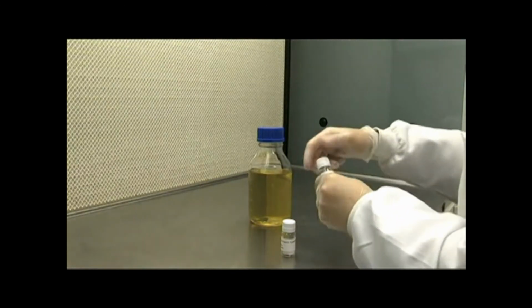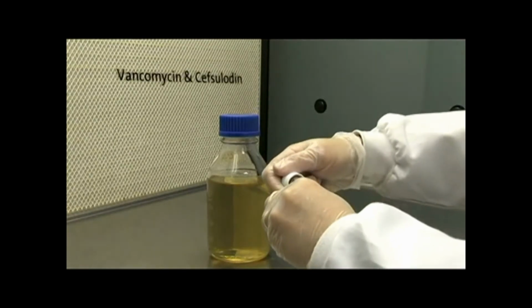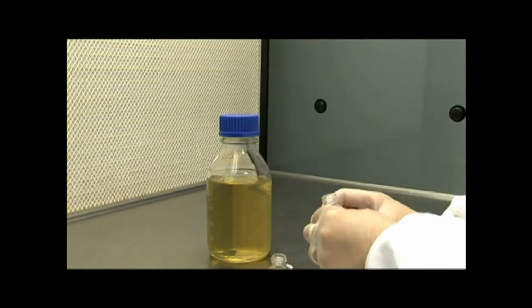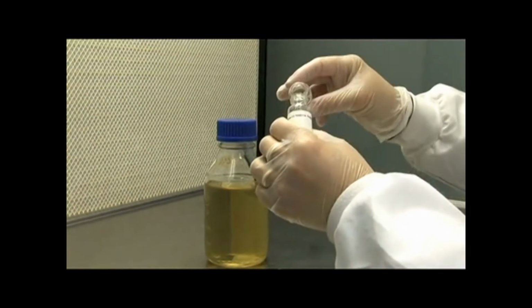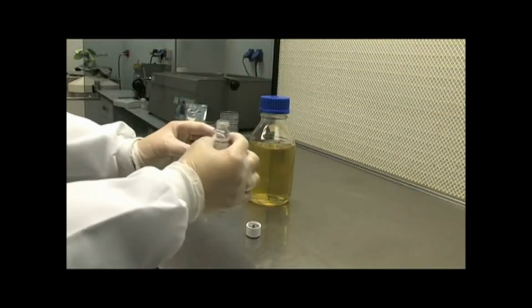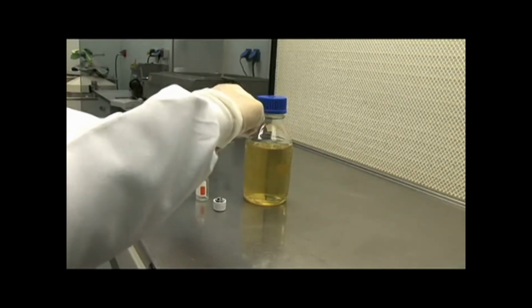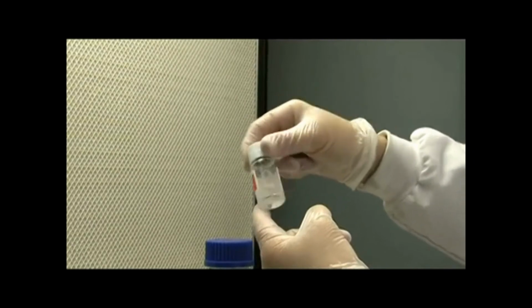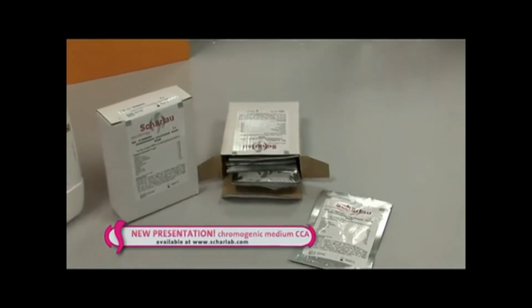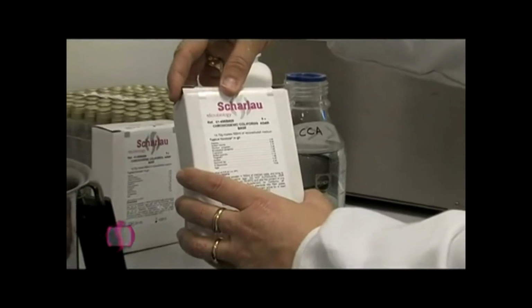This medium has an adjusted selective capability, which is very effective due to the antibiotics mixture included in its formulation. This selectivity is the result of the presence of cephalosporin, which inhibits Pseudomonas and other gram-negative oxidase-positive bacteria, and also of vancomycin, which inhibits the growth of enterococci and other gram-positive bacteria without affecting the recovery of coliforms. If you use our new sachets, you can pour the powder directly into 500 milliliters of distilled water without requiring previous weighing.